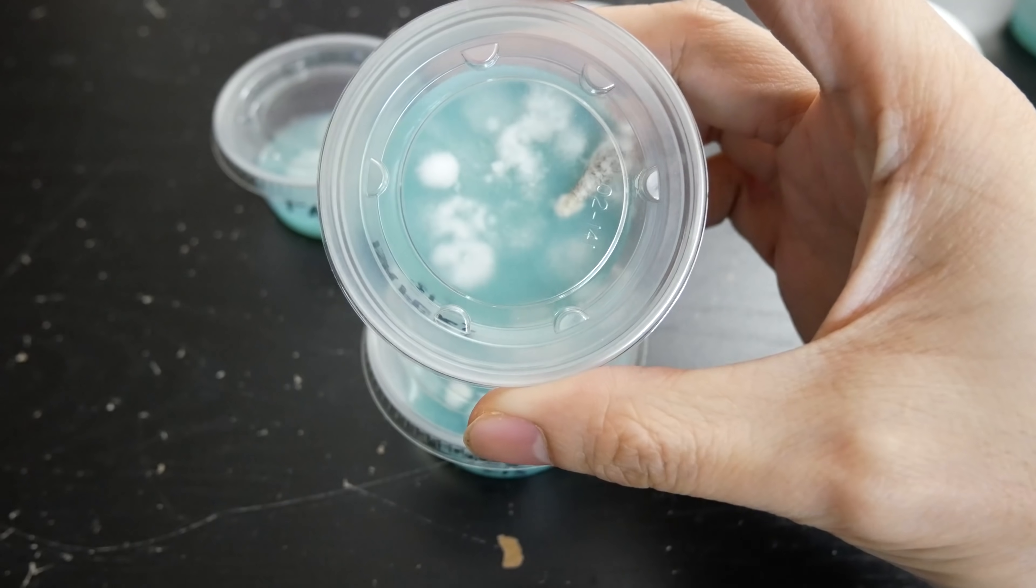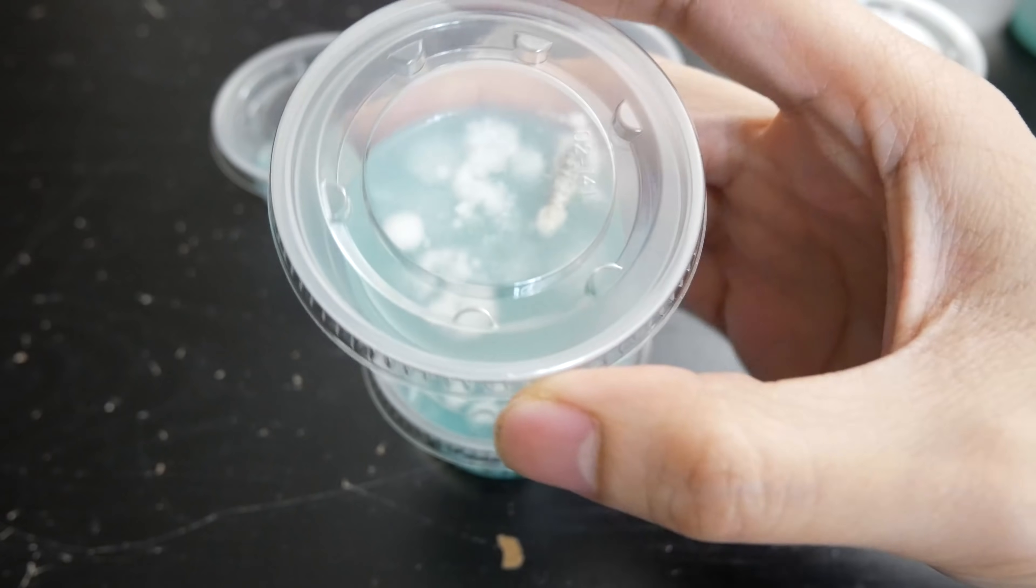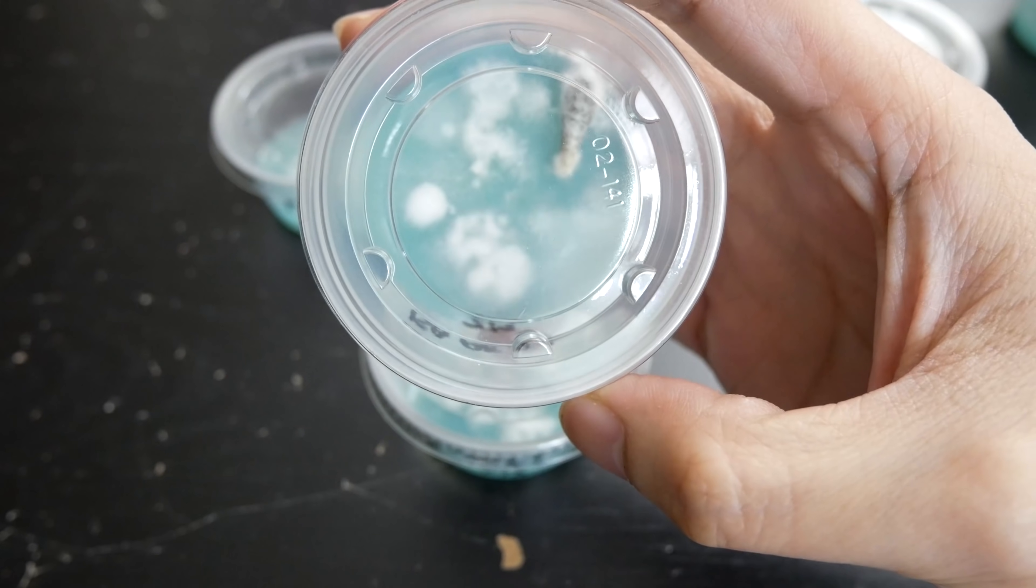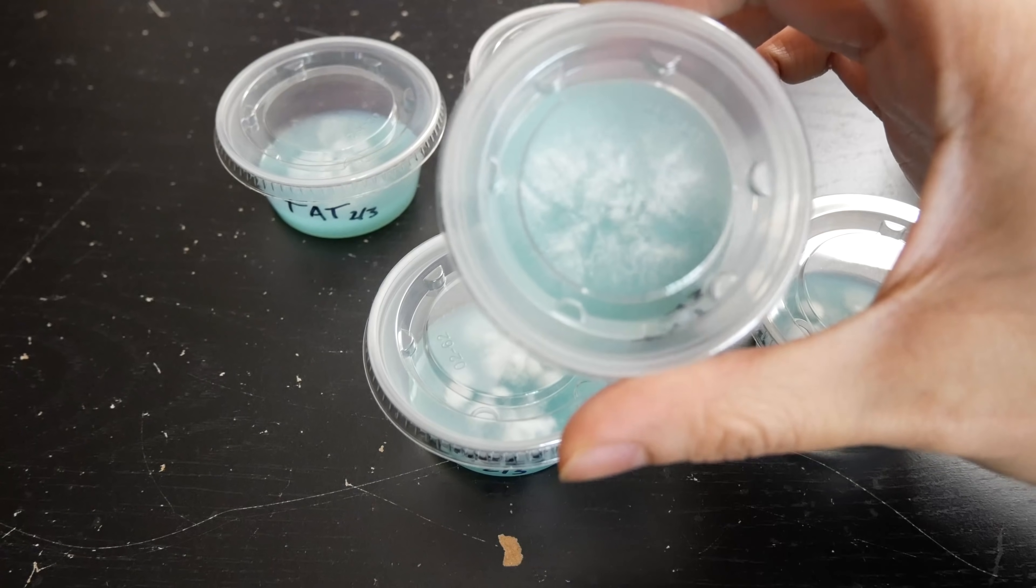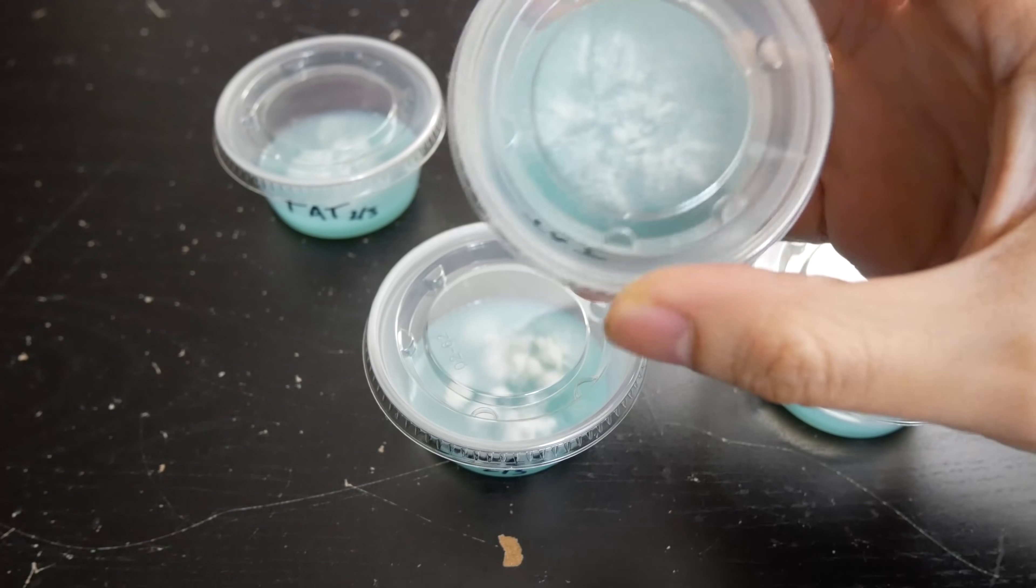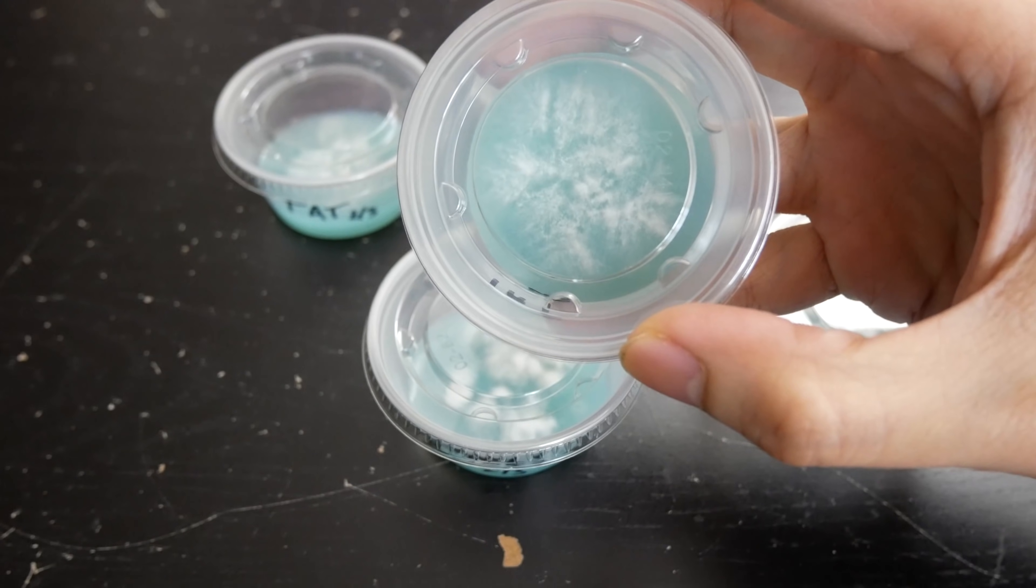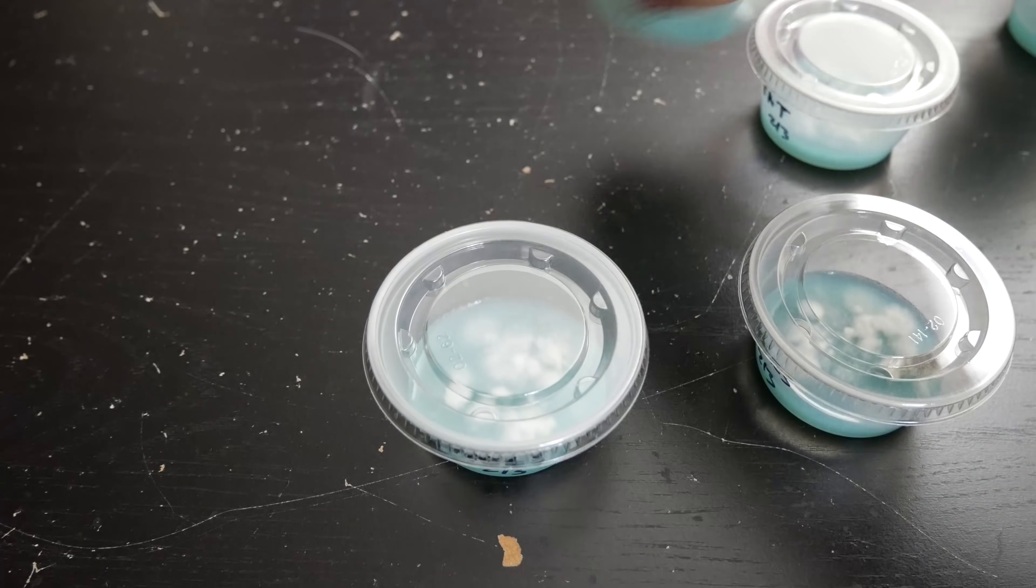So once you get them growing, pretty much a good sign that you got some mycelium on there that's colonizing, you want to start making transfers out of these and transfer them to new agar cups to colonize. Now these look pretty clean so far. However, sometimes you might get some contamination or bacteria that might be underlying and hasn't germinated yet. So it's always a good practice to make transfers and clean up your cultures on new agar dishes before you inoculate them into grain.